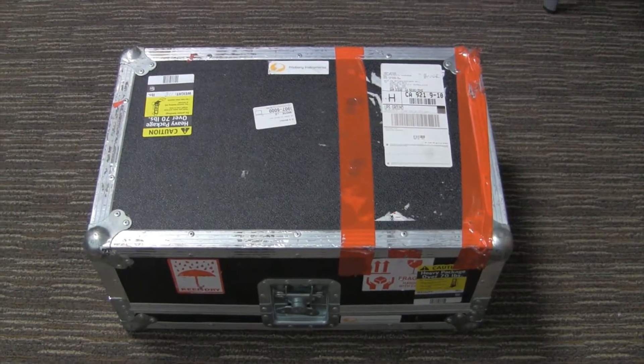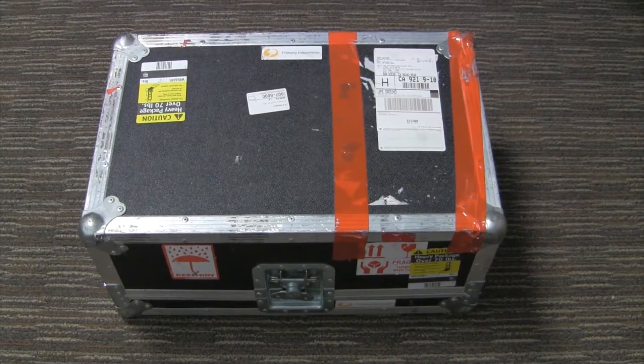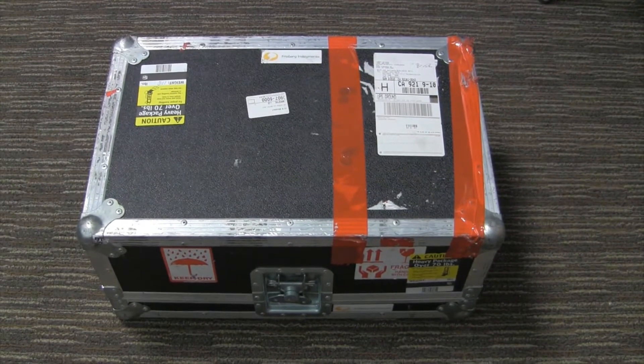This video covers unpacking the MS-5000 from its hard shell shipping case. First, be careful when lifting because the unit is over 100 pounds.